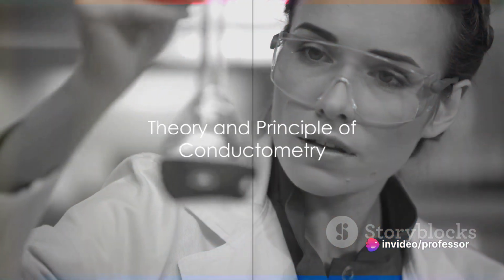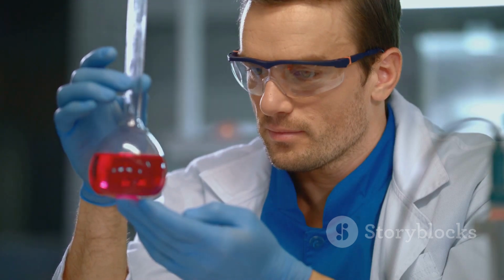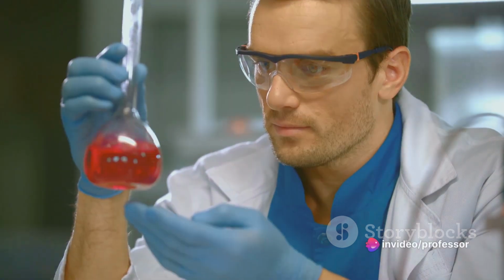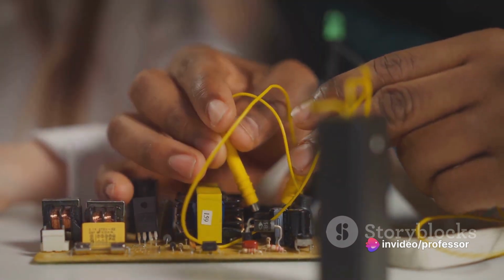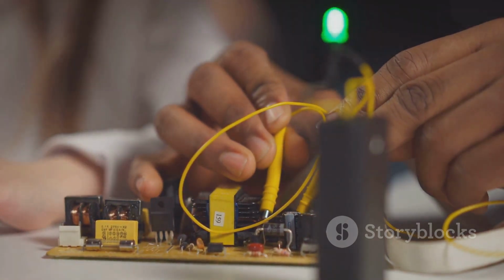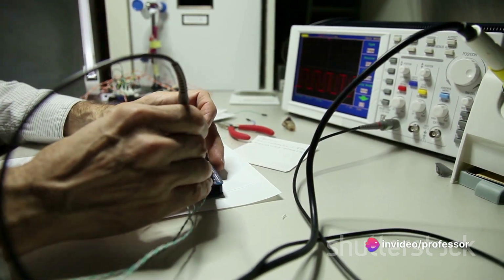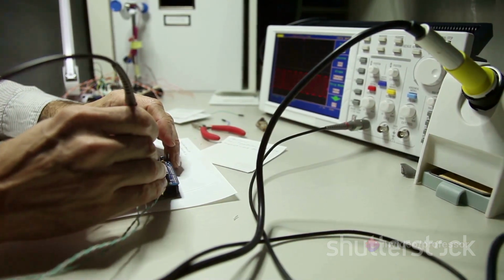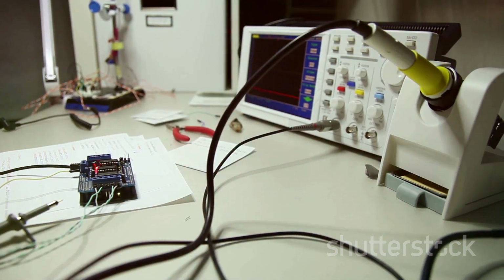To understand conductometry, we first need to grasp its underlying theory and principles. Diving into the heart of conductometry, we encounter the concept of conductance. This is the inverse of resistance, representing the ease with which an electric current flows through a substance. In the realm of chemistry, conductometry is used to measure this conductance, particularly in solutions where ions are the charge carriers. Now, how is this measured, you may ask? Well, it's through a method called the Wheatstone bridge principle. It's a clever setup where an unknown conductance is compared with a known one, and the balance point of the bridge gives us the value we're after.